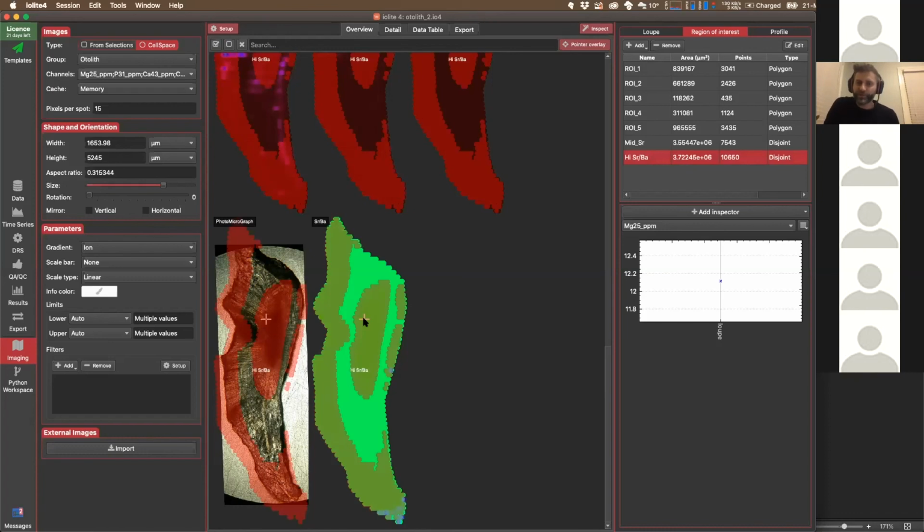Okay, Simon agrees as well. That's a good idea. We'll look into that a bit more. I think that if we can do the empirical cumulative distribution function, it shouldn't be too much harder to do percentiles, because we're already looking at basically the cumulative distribution.